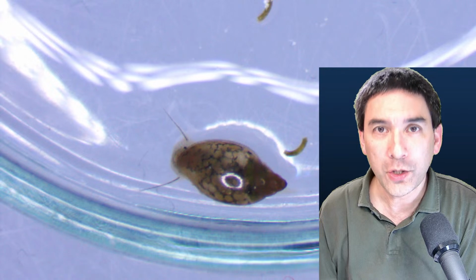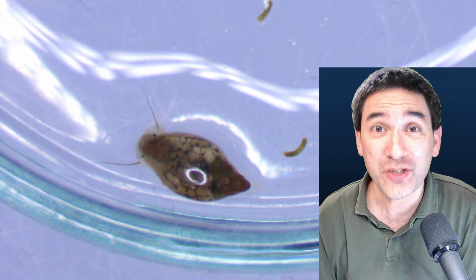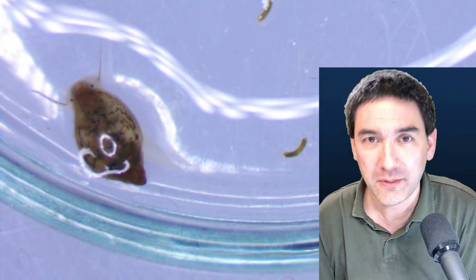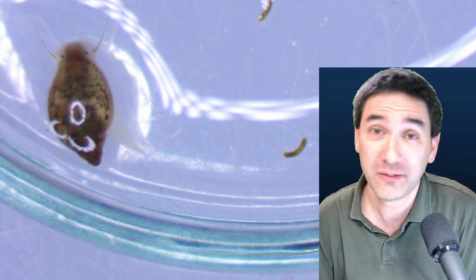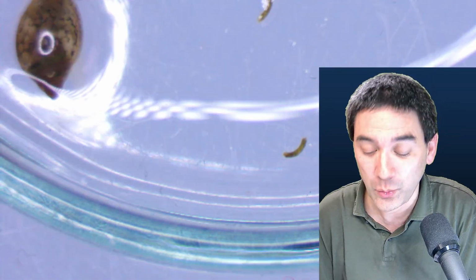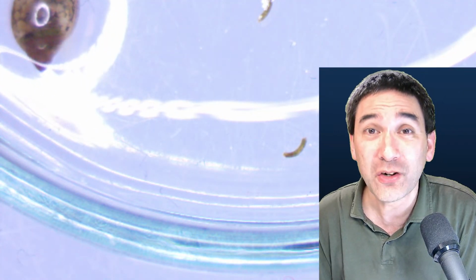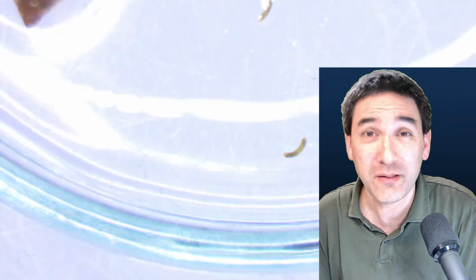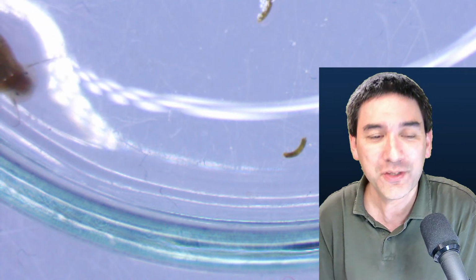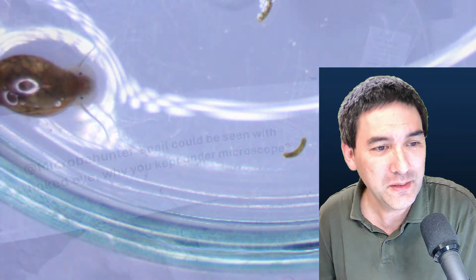Talking about water fleas, the water crustaceans like Daphnia, Cyclops, or the ostracods, and so on. I basically simply refer to them as water fleas, as a collective term. These are tiny water crustaceans. Fleas are actually insects, and they are not really closely related to them. They're both arthropods, but still. And the question is now the following. Let me go back here.